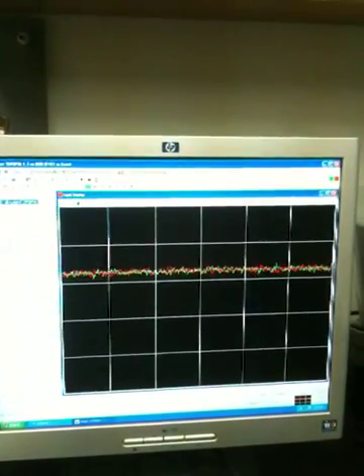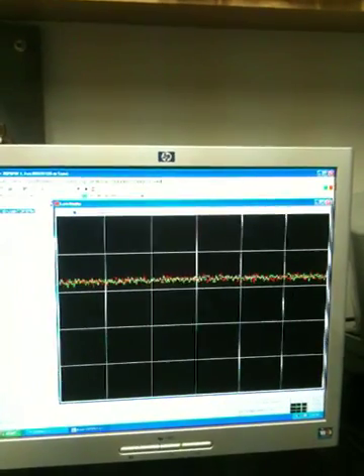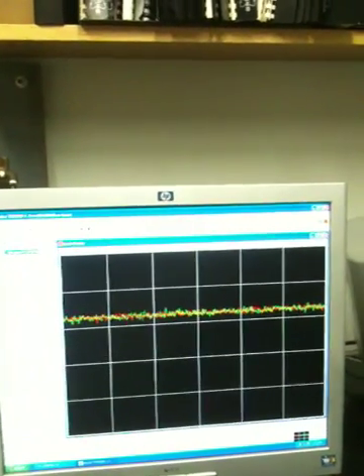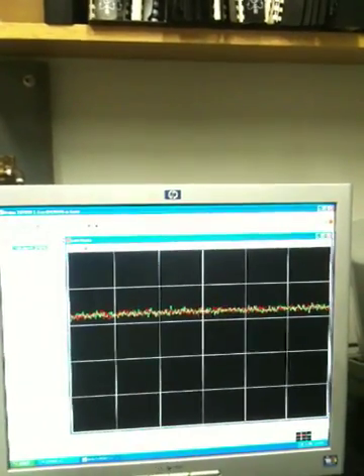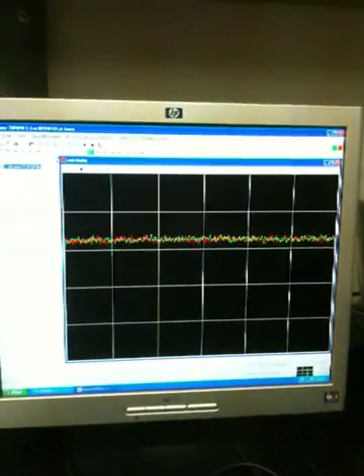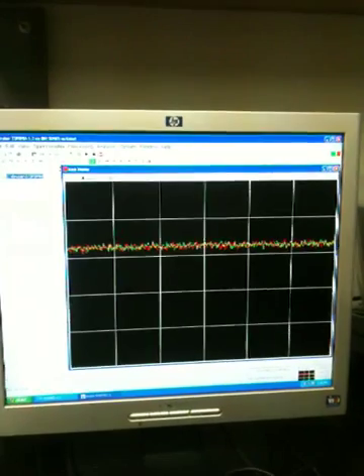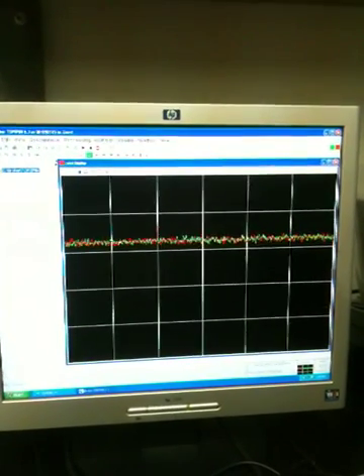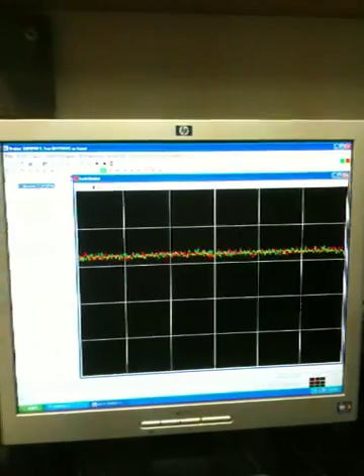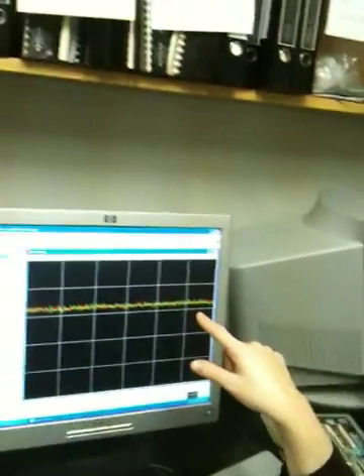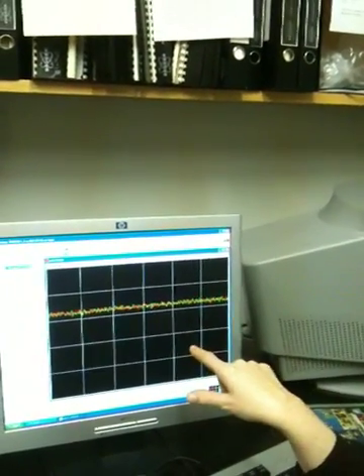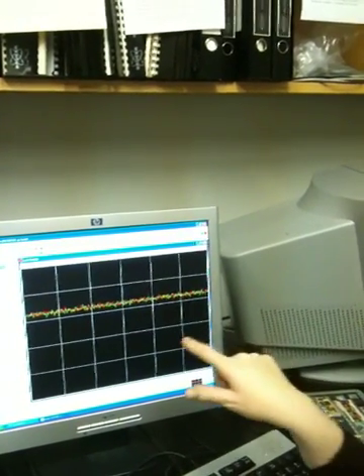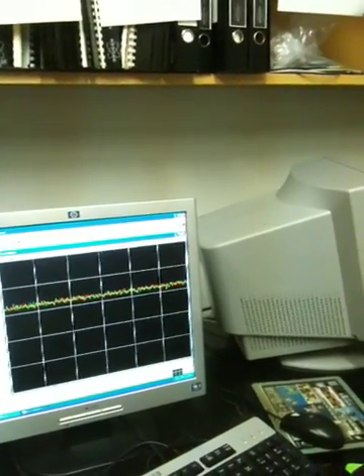The stronger the deuterium signal is, the more even the magnetic field is. And you will learn, NMR is all about the magnetic field and how even it is. It has to be very even. It has to be very homogeneous around the sample. You can't have a gradient in the field. This is our monitor of how even the field is, how homogeneous the field is.